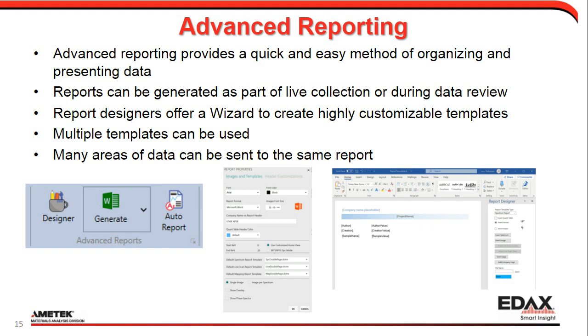Data from different areas can be sent to the same report. There are multiple templates to choose from for each collection mode. The report designer offers a wizard to create your own templates. You can design the layout, determine the items you want to include in the report, insert or complete a lab logo, change font size, and so on.